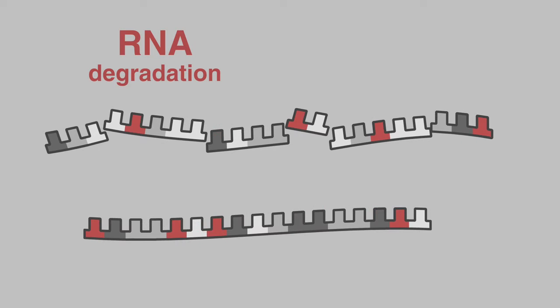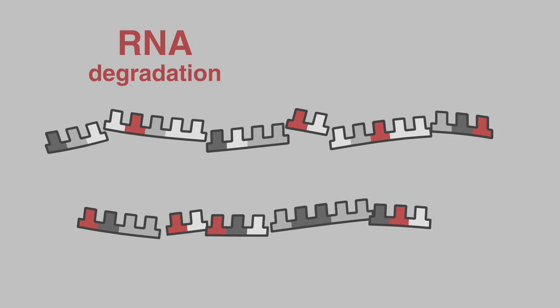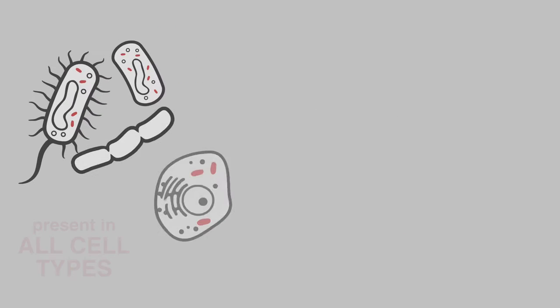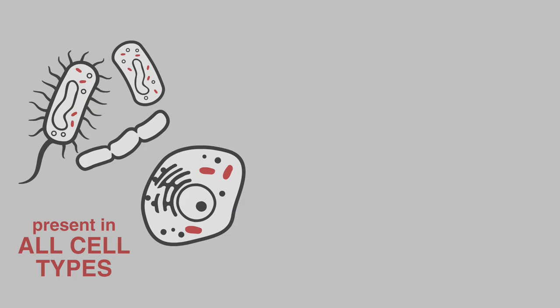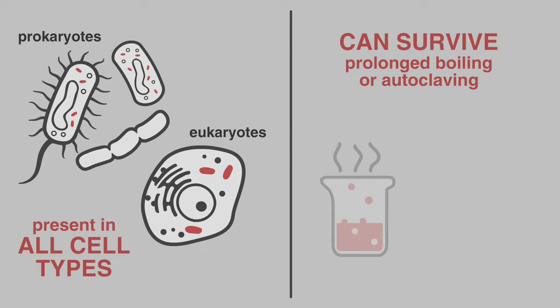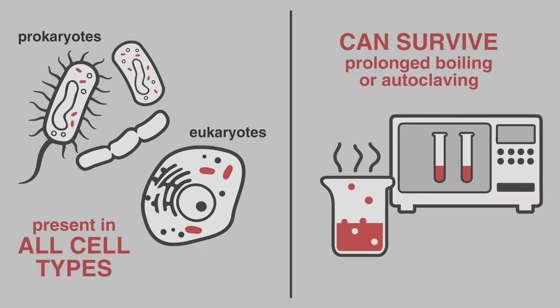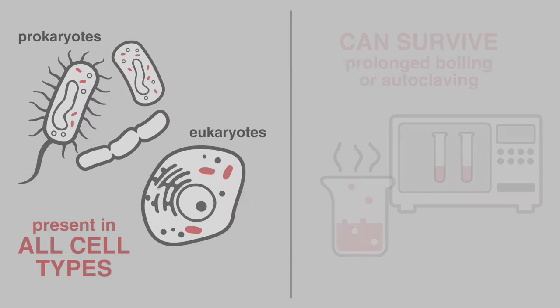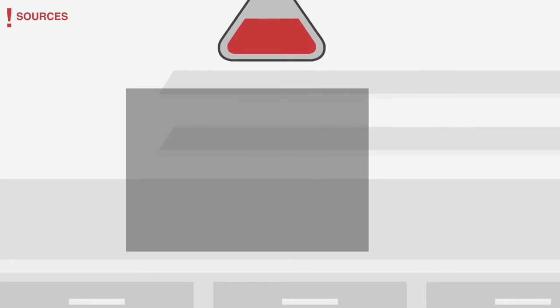Preventing RNA degradation is trickier than preventing DNA degradation. RNases are present in all cell types from prokaryotes to eukaryotes and can sometimes survive prolonged boiling or autoclaving. So, what are the major sources of RNase contamination in the lab?